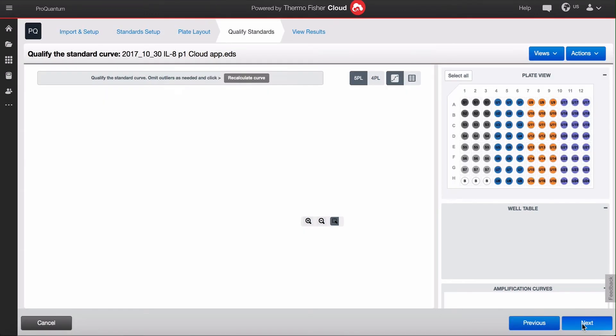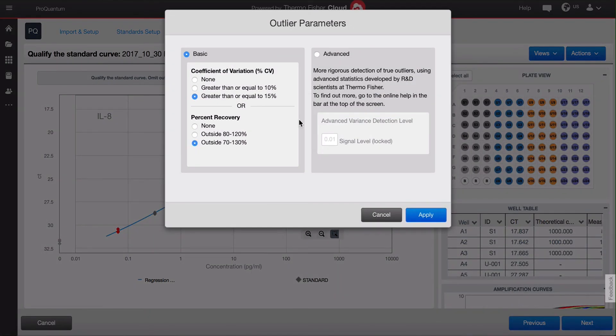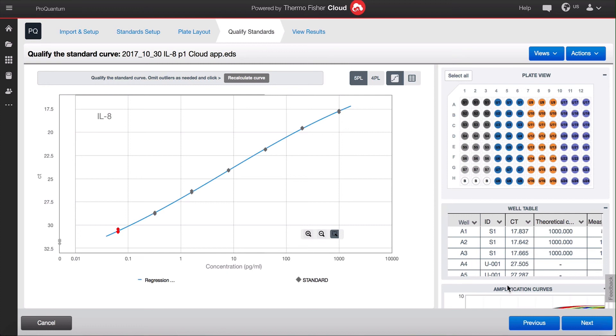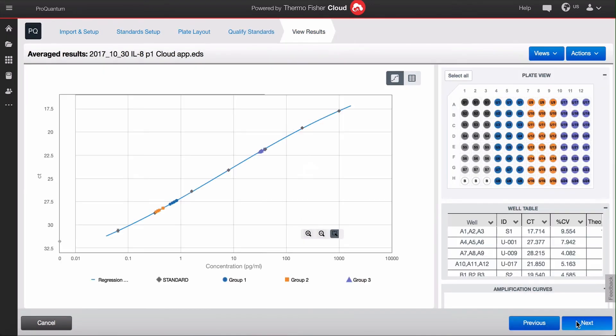You'll need to qualify your standard curve. Under the action button, there's an outlier detection tool to help flag any wells you may want to omit. Once you're satisfied with your standard curve, your unknown samples will be plotted on the curve.